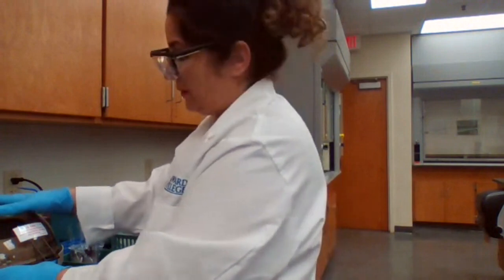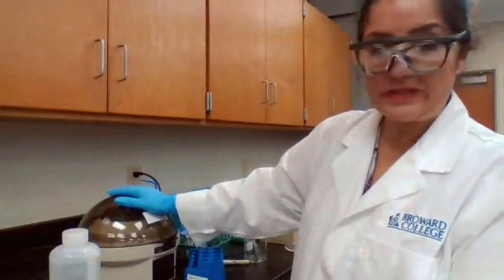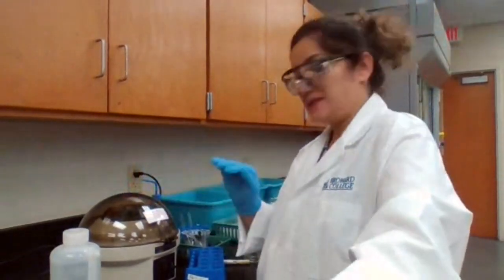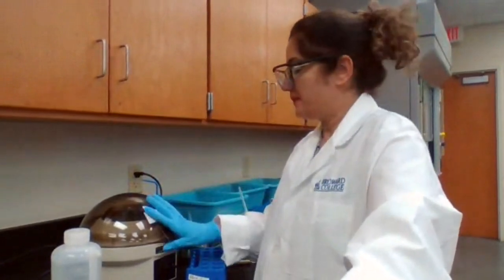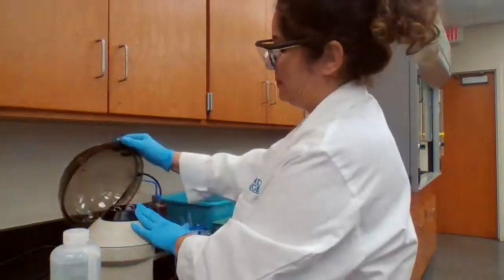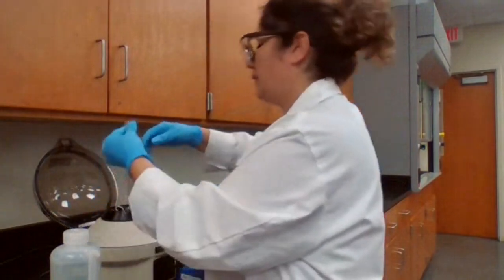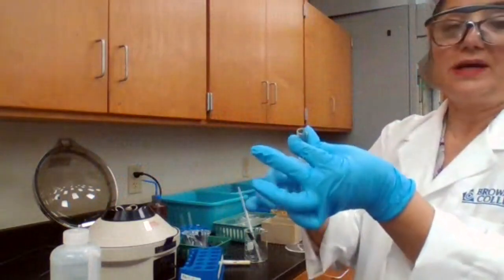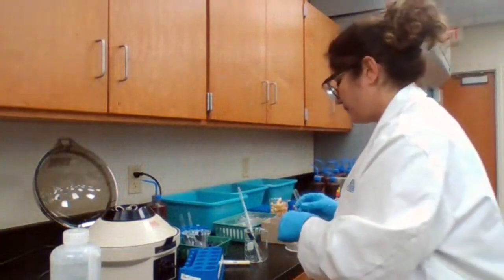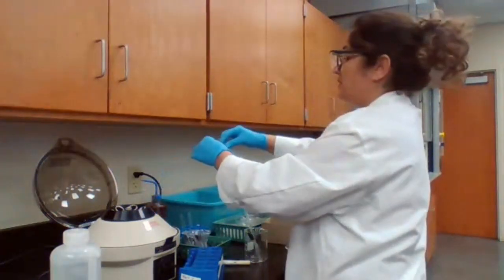Okay, you're just washing the precipitate, right? So when the centrifuge stops, I open it, and the solutions I don't need. I need the precipitate. This blue color is not good because it interferes with the next part. So I'm going to discard it.